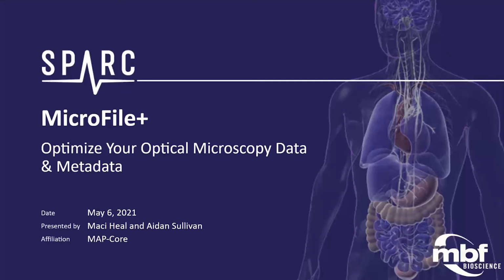Attending our webinar today. We're excited to share with you how you can use our free image converter, MicroFile Plus, to optimize your optical microscopy data and metadata to comply with the SPARC standards for optical microscopy imaging data.